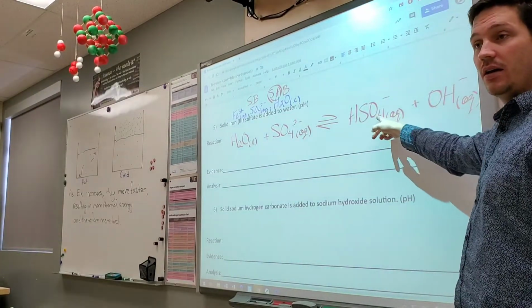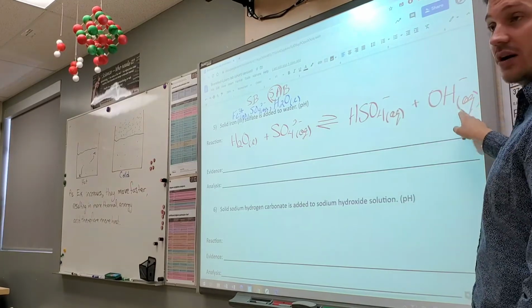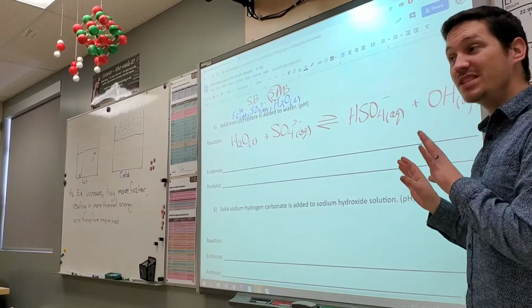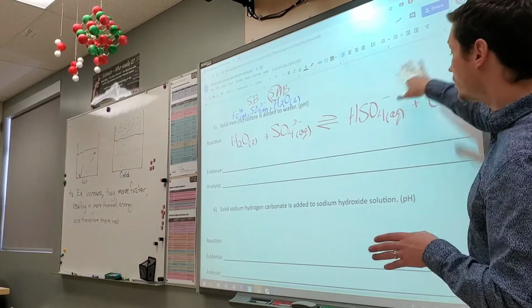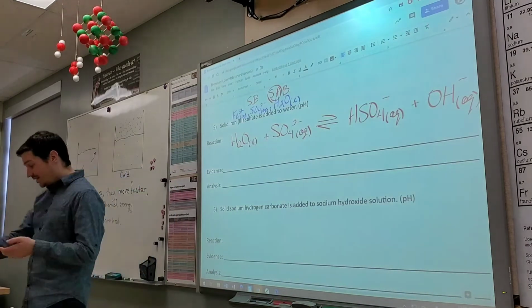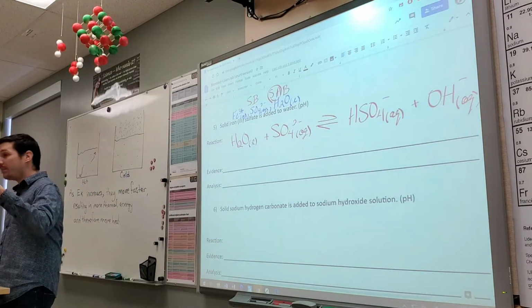Why? The hydroxide. Would you agree? If something's making hydroxide, that sounds like a base to me, right? So this solution should be basic. So let's test this, and let's see if it actually happens, right?